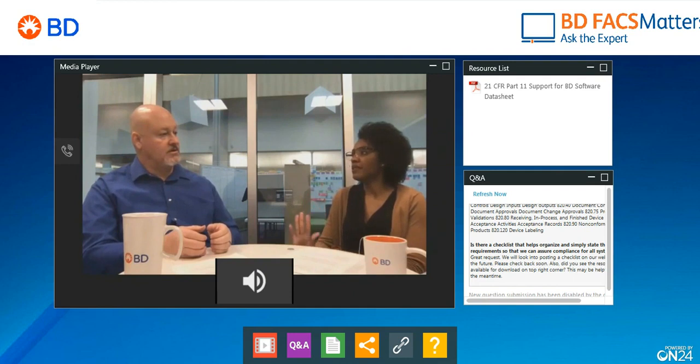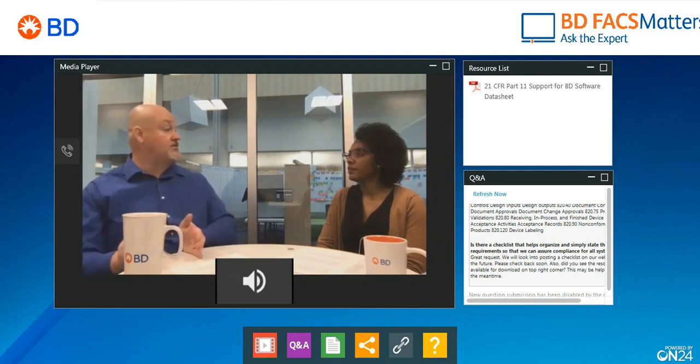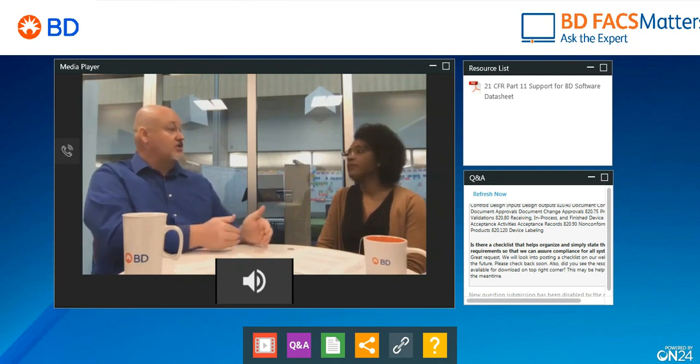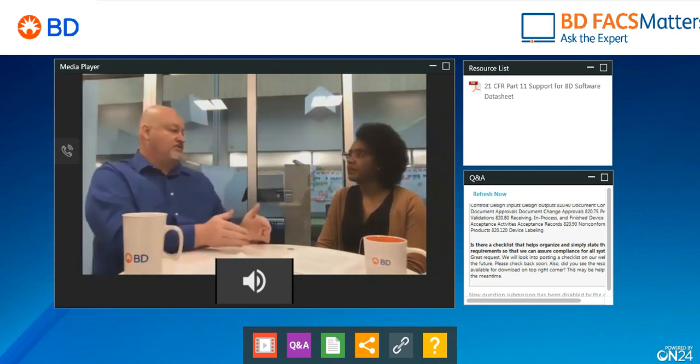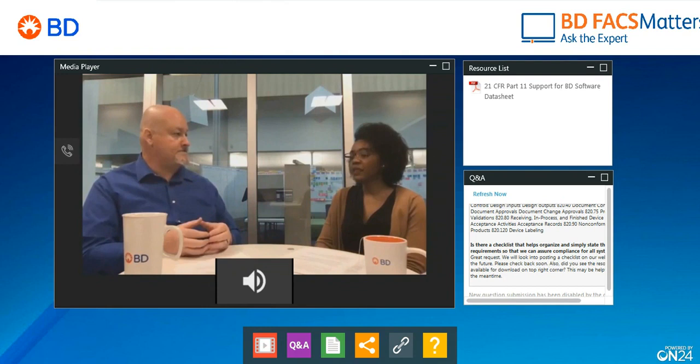Under what circumstances? Well, for example, if we have a company that does both clinical and research, they may not need those regulations to be in the research area. So they may be doing internal items that they're not going to report to the FDA. Okay. So Part 11 may not be applicable to what they're doing. So they may want to be able to turn it off to just save their laboratory people and their experts some effort. I see. And then there's also the wet signatures would still be allowable.